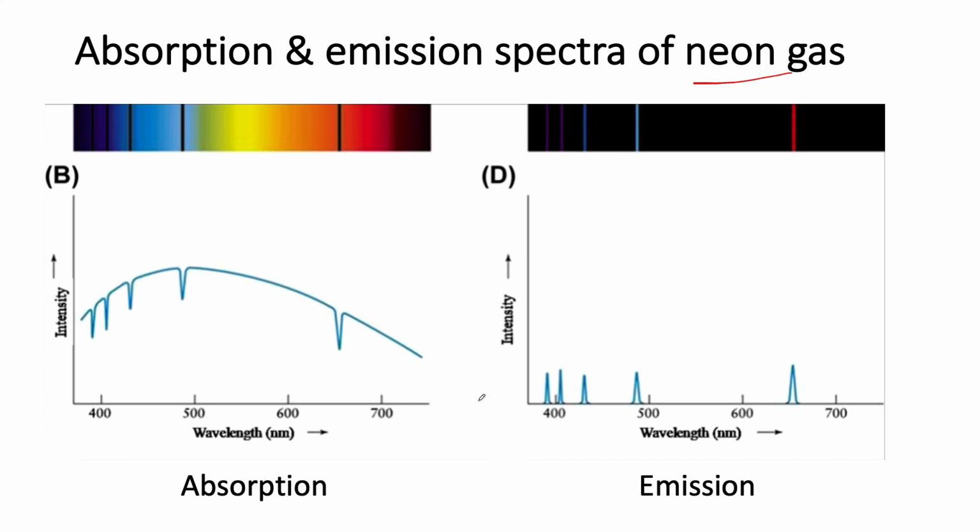But what you end up seeing is the energies coming back at the same wavelength. So these are exactly the same wavelengths, but they now occur as an emission spectrum. It's coming from the gas. You don't need a light source to light this up. All you need is, in this case, a voltage source to cause the plasma to break down the neon gas. And then you just look at the wavelengths coming out, right?